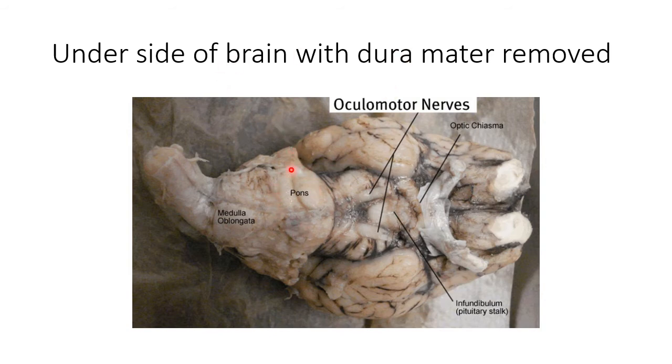This is your pons and medulla oblongata. The medulla oblongata is very important for controlling respiration and for fine-tuning the heartbeat, though the heartbeat has its own motor and its own electrical impulses. And then you go into the brainstem and spinal cord. That's about what we have to look at on this slide.